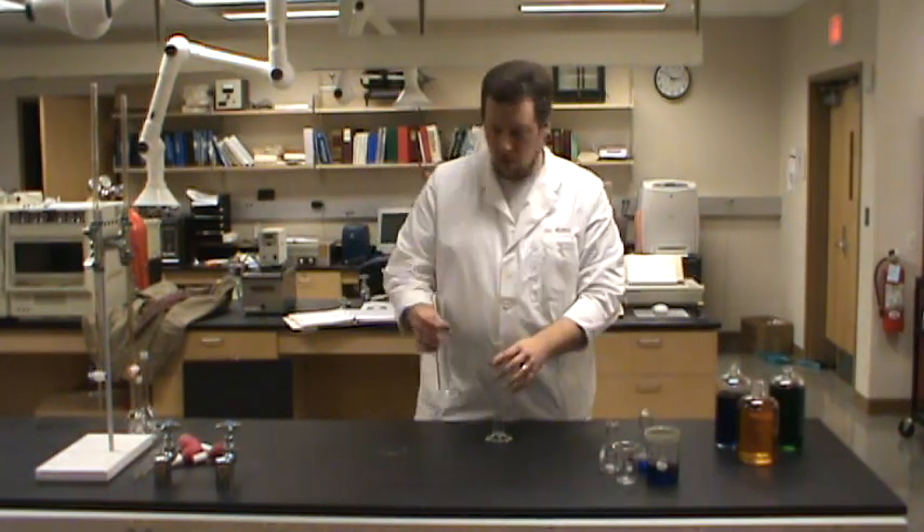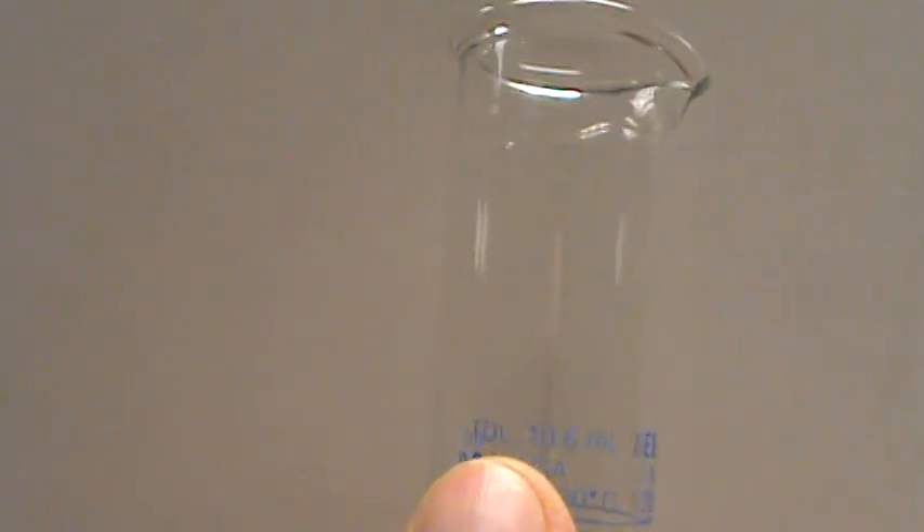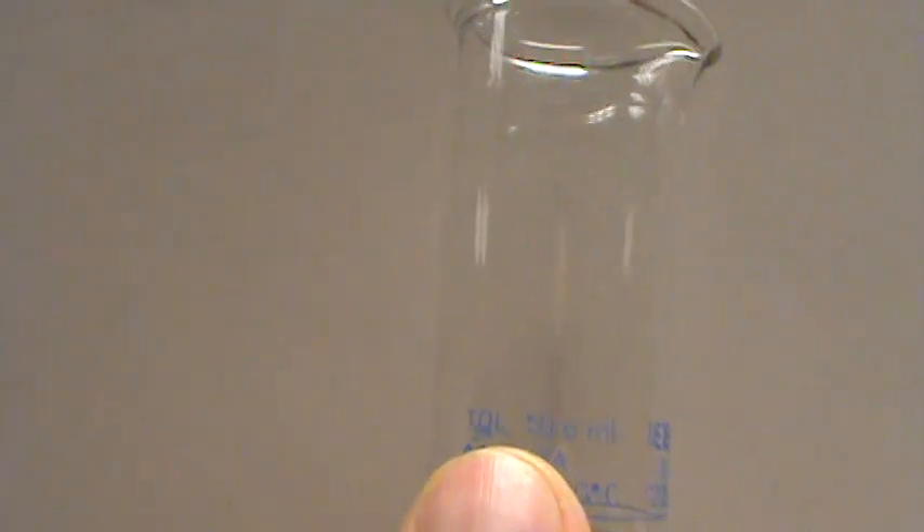What about these graduated cylinders? If we look very closely at the label on this graduated cylinder, it shows us that TOL — that's tolerance — is plus or minus 0.6 milliliters. That's pretty good. 0.6 milliliters on up to 100 milliliters is a pretty reliable piece of measurement.